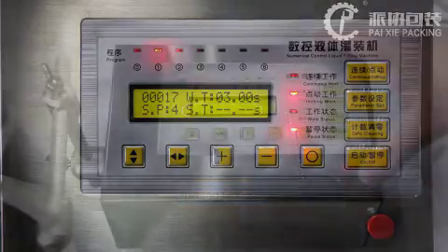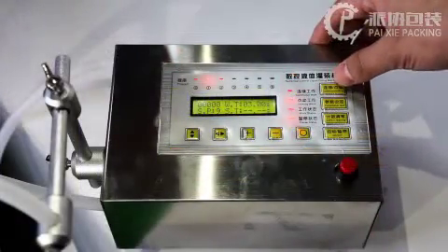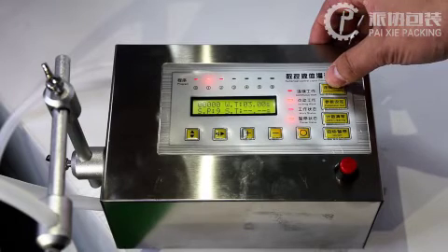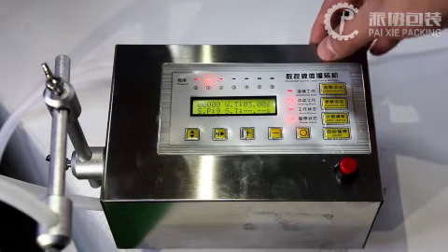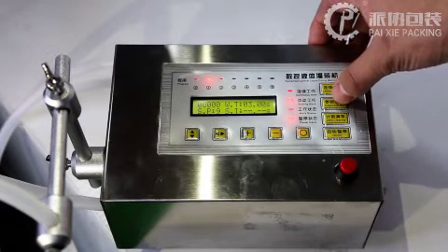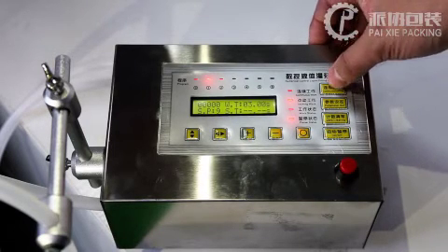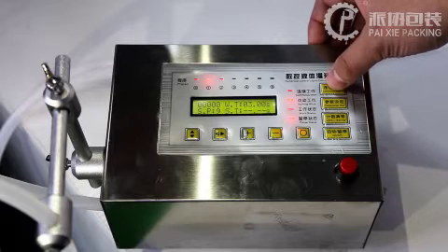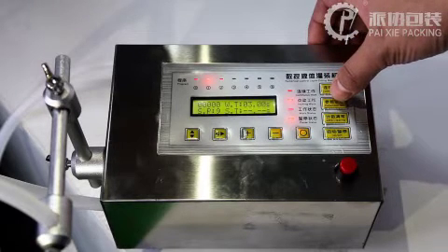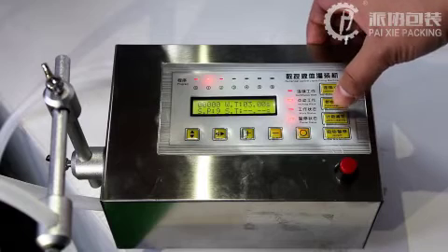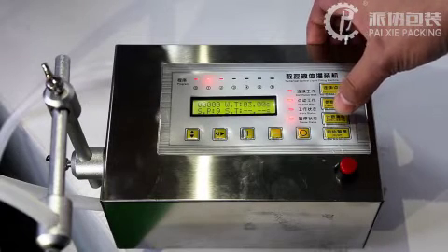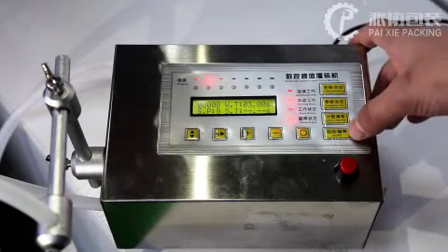Let's test our feeding machine. This button is continuing work, and manual work. This is parameter set. This is zero clearing. This is power on and power off.